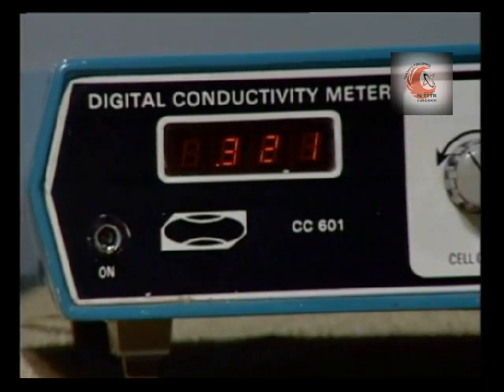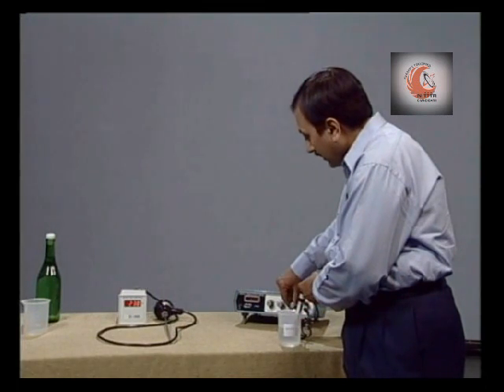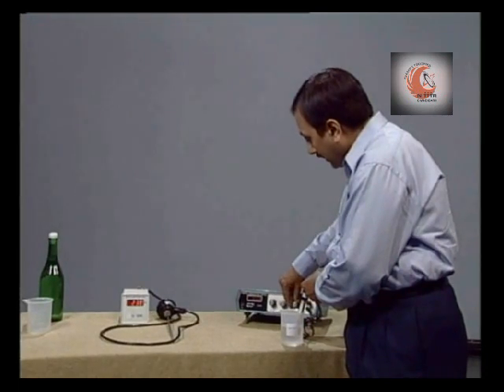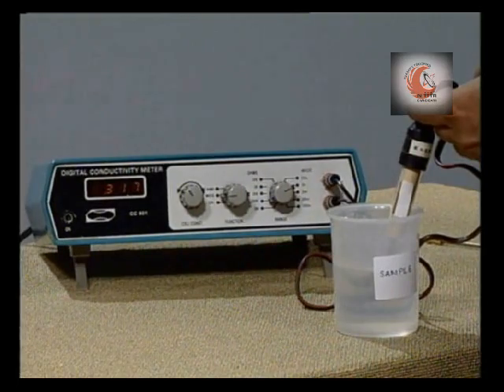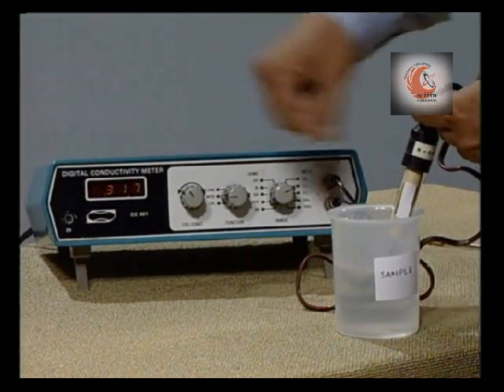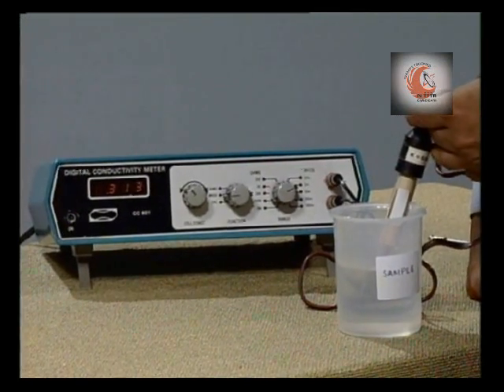So, to get better accuracy, we will put the instrument in the appropriate range accordingly. When the reading is stable, we will note down the value.